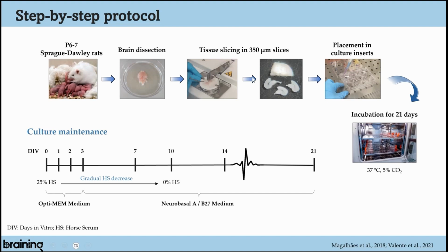The second difference is that the publications in the literature describe keeping the slices in Optimem medium supplemented with 25% horse serum until 2 days in vitro.